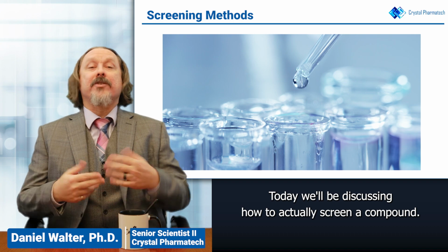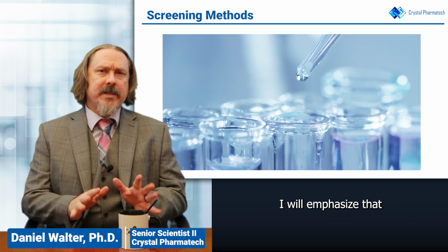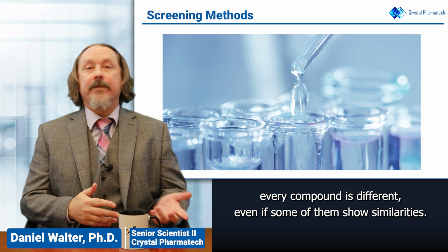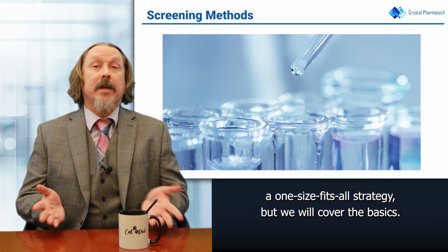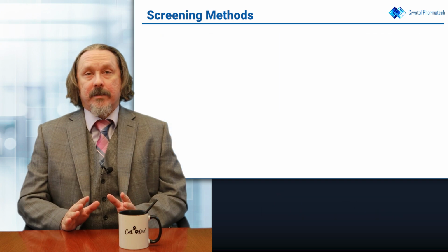Today we'll be discussing how to actually screen a compound. I will emphasize that every compound is different, even if some of them show similarities, so there isn't necessarily a one-size-fits-all strategy, but we will cover the basics.